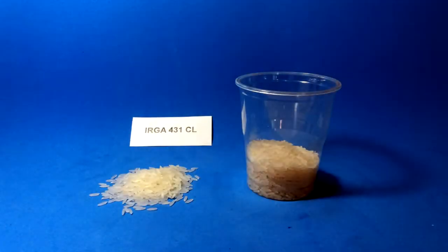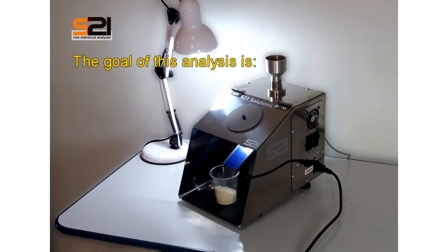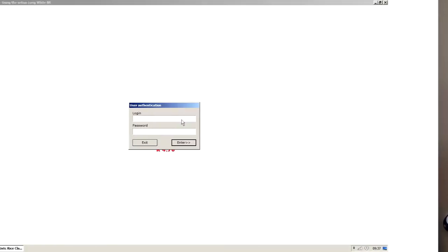In this video, we're going to analyze a sample of a long thin rice from the Irga 431CL variety. The goal of this analysis is to find the average length of the perfect whole grains and also generate a histogram of the chalky area of the sample. This type of analysis is largely used in research centers for developing new varieties.